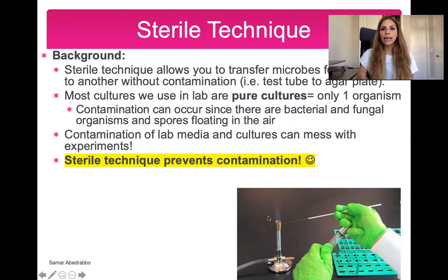So there is contamination everywhere. There's contamination on your lab bench. There's bacteria on our hands, there's microbes everywhere, there's fungal spores everywhere. So we want to make sure that we always use sterile technique when we're running experiments. And sterile technique prevents contamination.